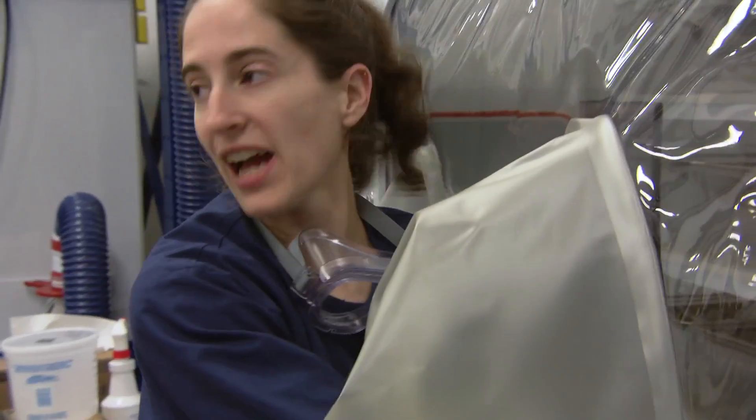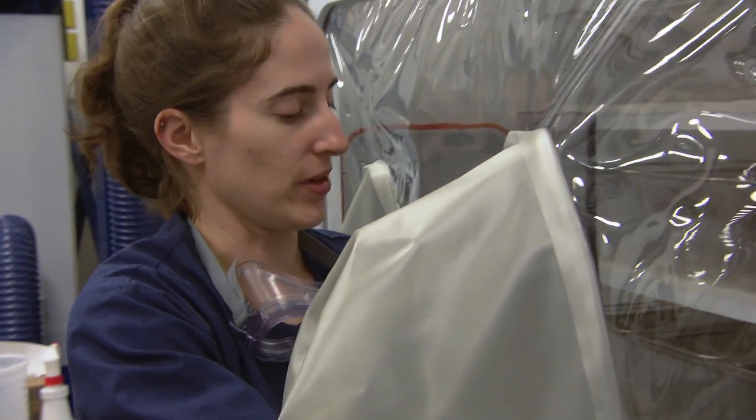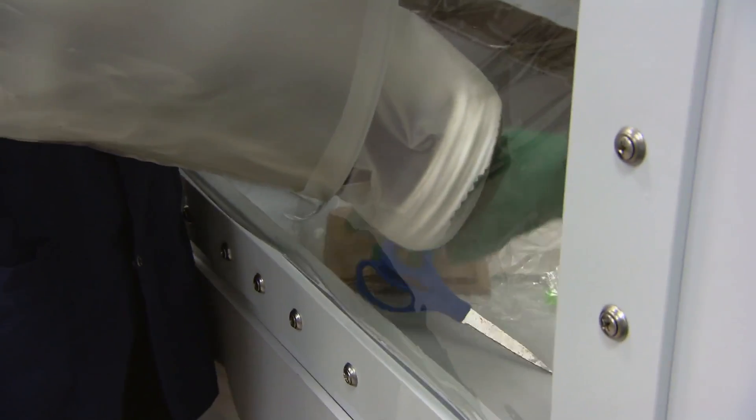All of our technicians have timers they keep with them when they're spraying items into their isolator. They make sure to get the full wait time.